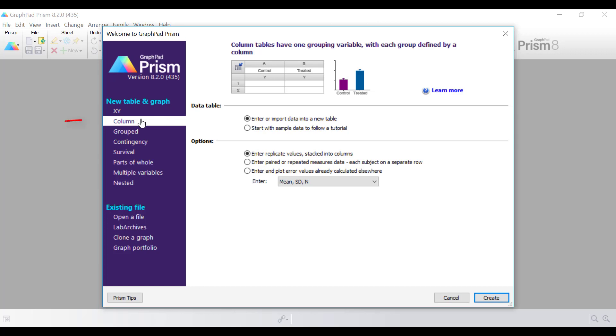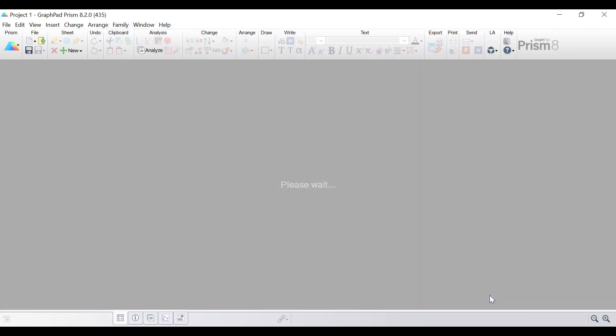So for the setup, I'm going to select a column table and graph. I'm going to enter and import data into a new table and enter replicate values stacked into columns and then click the create button.